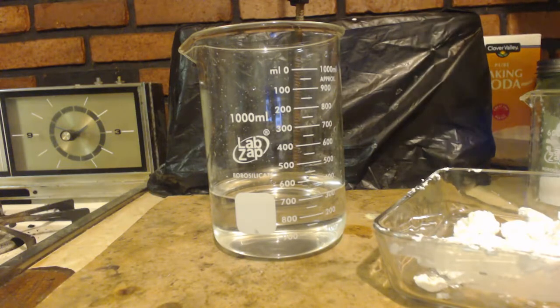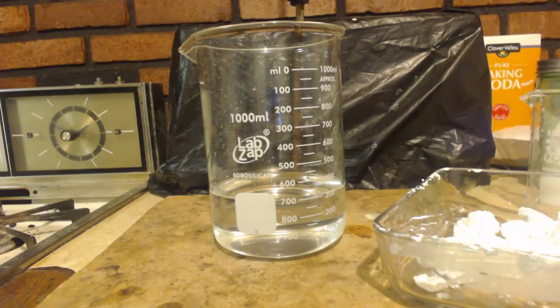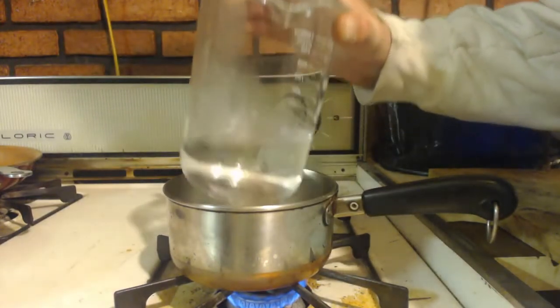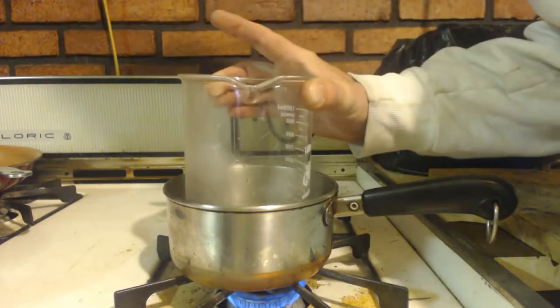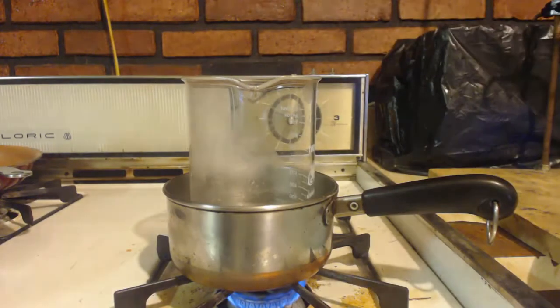Maybe even half a gram. So we're not going to let all the water evaporate, but we're going to evaporate some of this water down. It's boiling, and I got some crystals coming out of solution. I'm just going to let it cool down naturally the rest of the way.